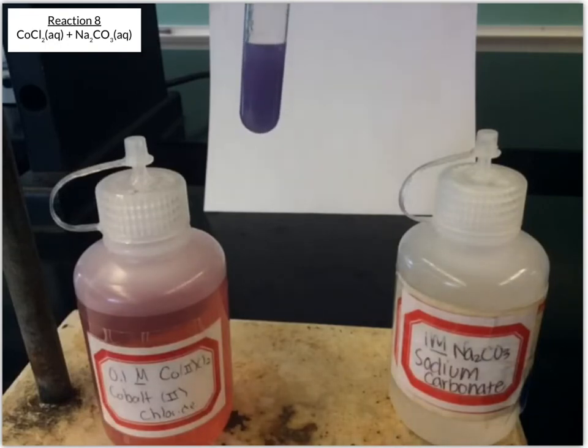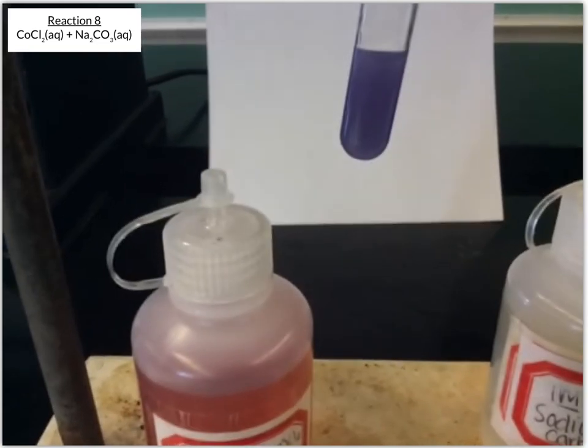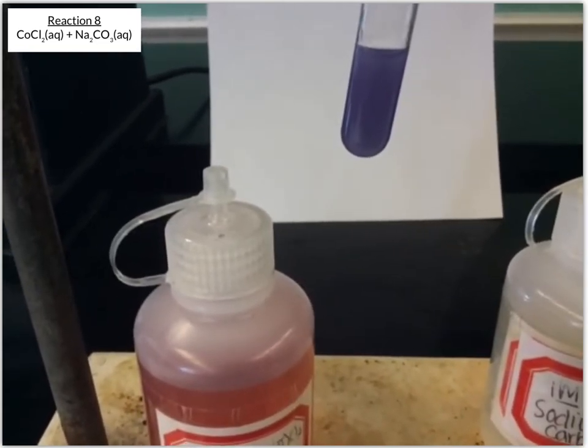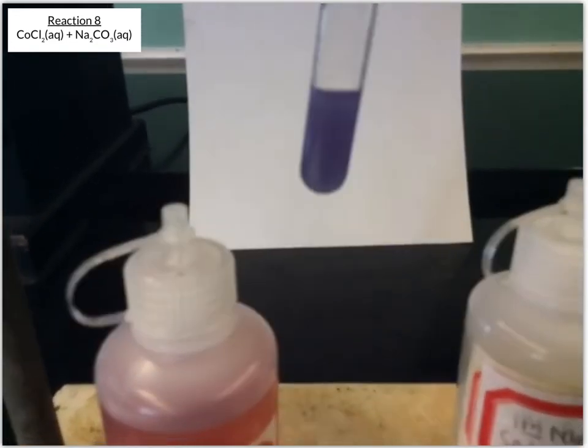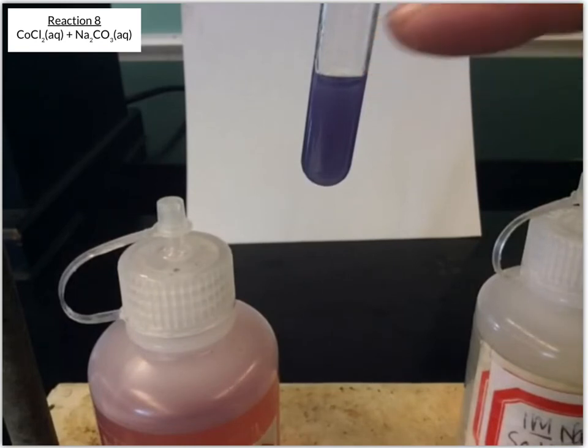Okay, so we've got it mixed, and like we've seen with some of the others, now it's a colored solution. It's this purplish blue, but it's not a clear solution. You can't see through it. It's kind of cloudy, and so that indicates there's likely solid in there. And actually, if you look a little higher on the tube, you can see that from me mixing, there is some solid stuck up on the edges of that tube.